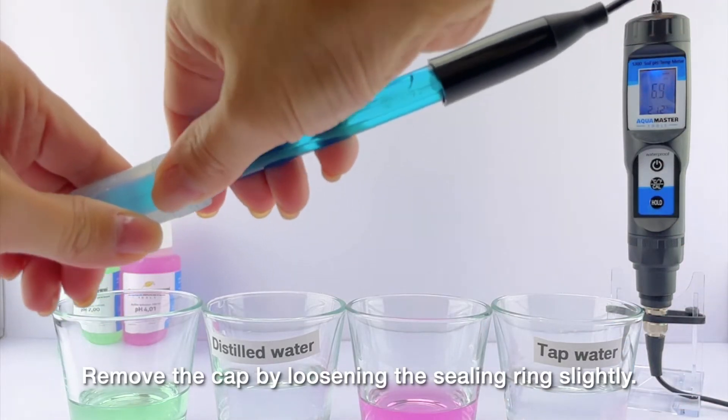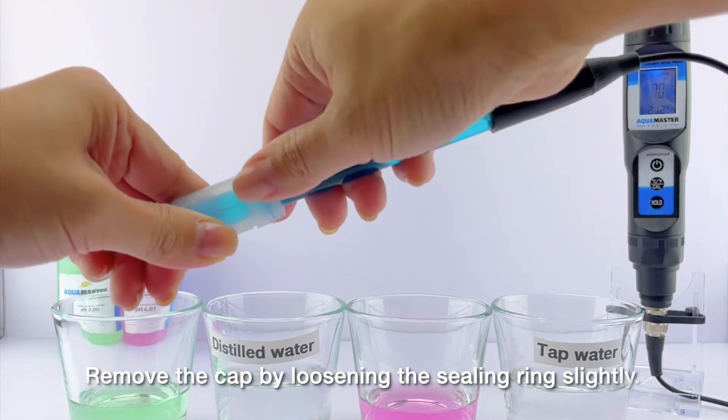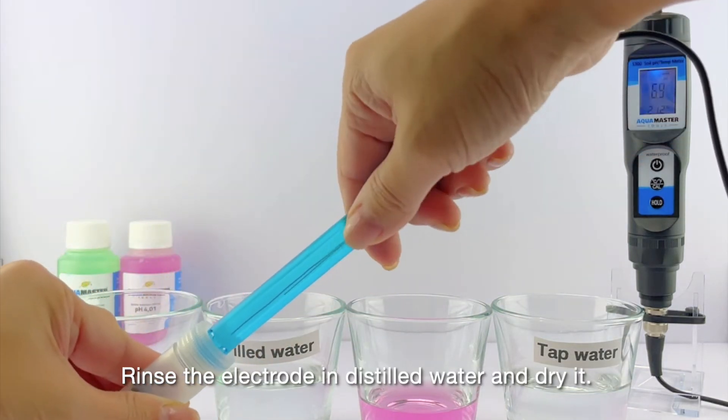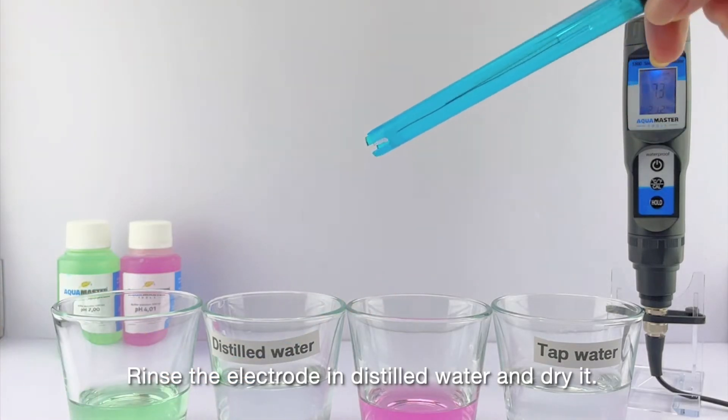Remove the cap by loosening the sealing ring slightly. Rinse the electrode in distilled water and dry it.